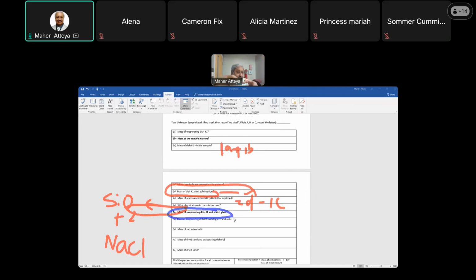and then I have the second evaporating dish and decant. Try to avoid taking any particles from the sand, because sodium chloride will be soluble in H2O. Sand will remain wet inside at the bottom. So I decant just the liquid. Then I add an additional 5 mL, a second time, and then stir, decant to dish. This, my hand, represents dish number 2 with the liquid here.